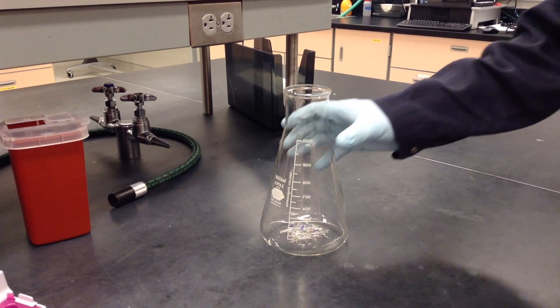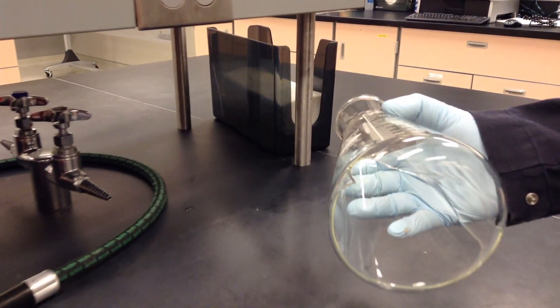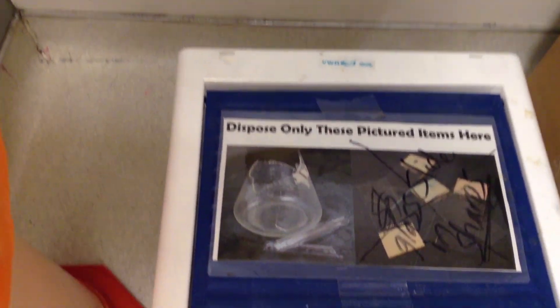It is likely that you will encounter broken glass in this lab. If you do, notify your TA, especially if a large piece of glass has broken. To clean up, carefully pick up the large pieces and take them to the broken glass container bin, which is located at the front of the lab. Here you can discard broken glass ranging from beakers, flasks, and microscope slides.